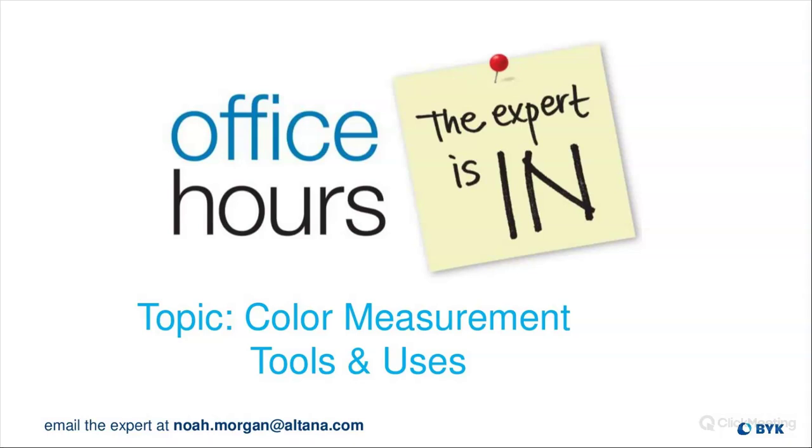Usually what's nice with choosing your instrumentation is that you usually have standards set in place, or you're following ASTM or ISO standards, and they usually call out what type of geometry or what type of spectrophotometer is needed depending on what you're doing. So that's always a good resource to have on deck whenever you're looking for something, or trying to figure out at least where to go and what you'll be measuring.